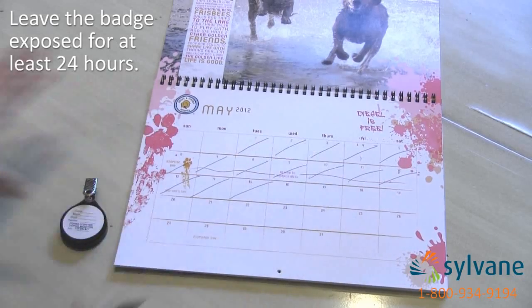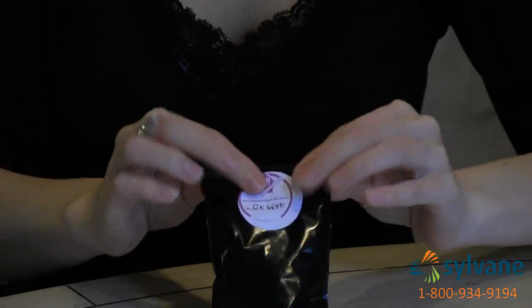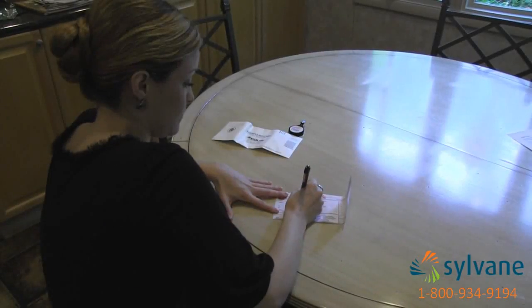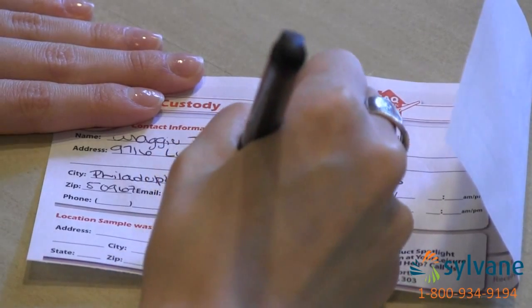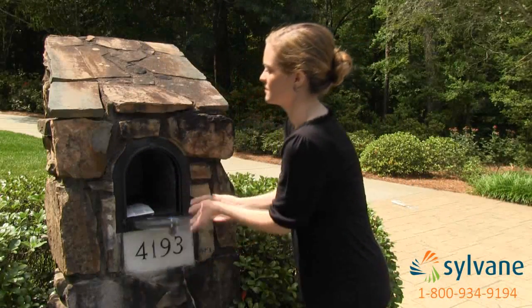After 24 hours, put the badge in the clear plastic bag and place that inside the black plastic bag. Complete the chain of custody form. Include your email address to receive the results by email. Mail the sample and the form to the lab using the prepaid envelope.